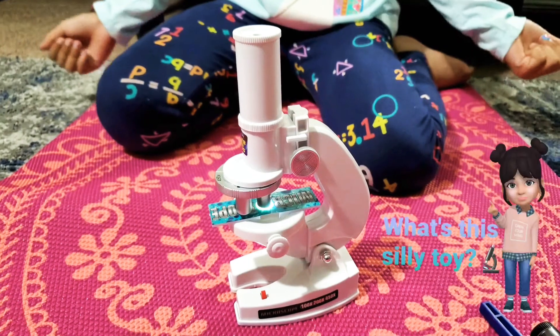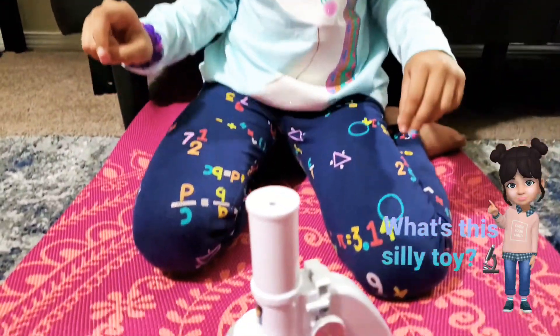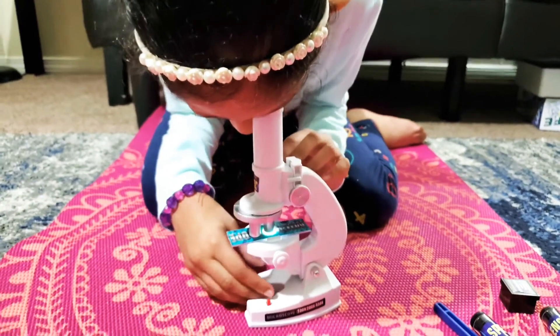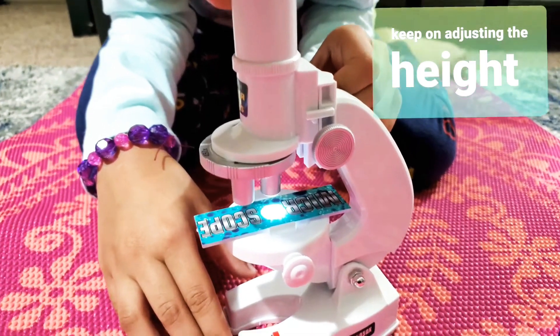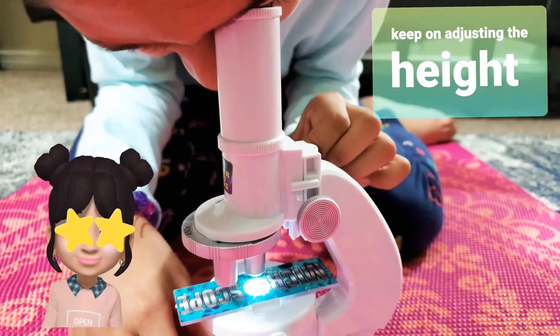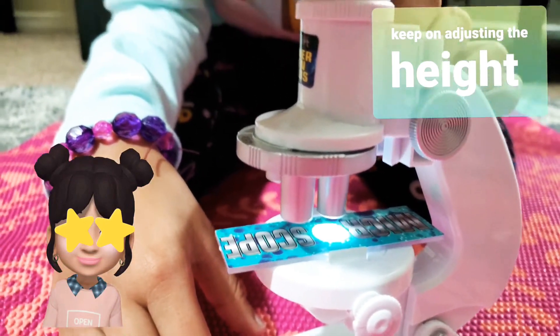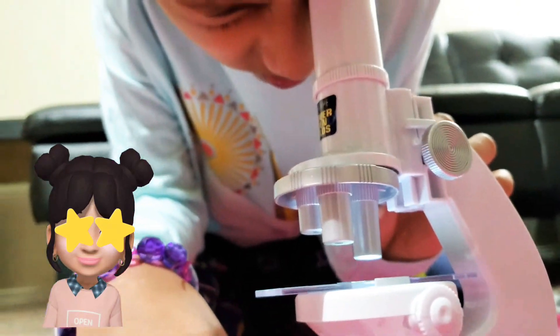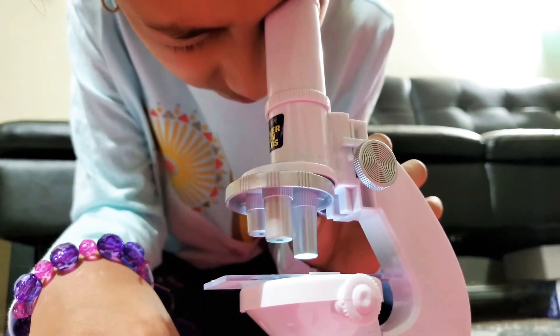The important thing is to adjust the heights. Let me quickly look. Oh, I can see it! It's like yellow — kind of hairs, it's almost like hair. Yeah, this is so cool. Oh my goodness, that is a lot of hair! That was so cool, it's almost like a zoom in.